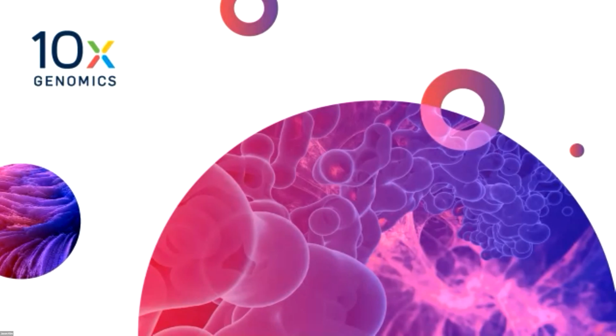But you want to open them up enough that you get as much capture of the mRNA as possible. What the studies have shown is that if they dialed in that permeabilization time correctly, the lateral diffusion is actually 1 to 3 microns, which, I'm going to be honest, surprised me. It was not as much as I had thought. And so there's a dead space that is inherent in the design, not because of the diffusion, but just because the probes can only be stuck close as possible.